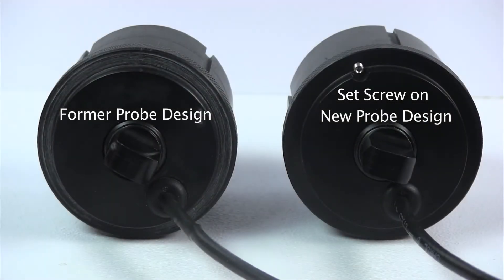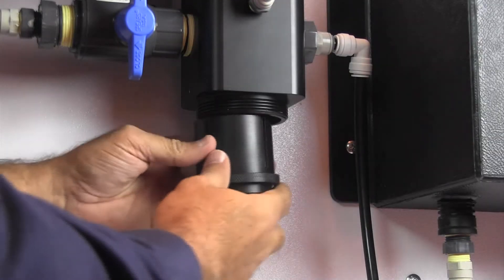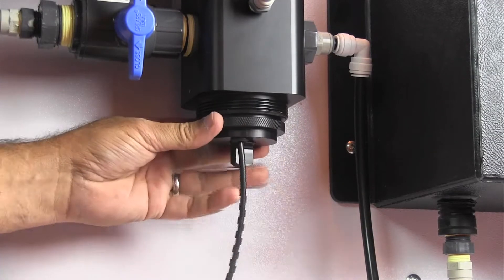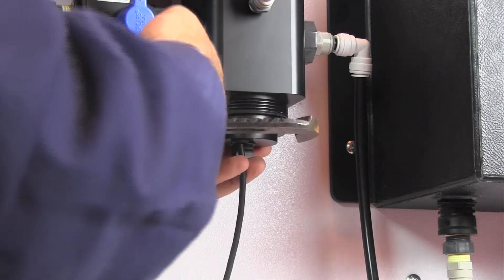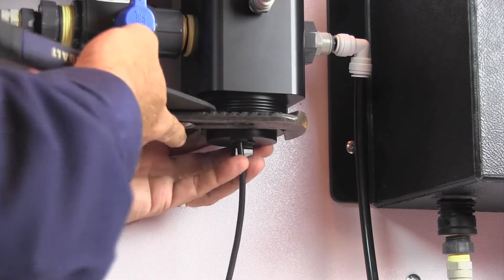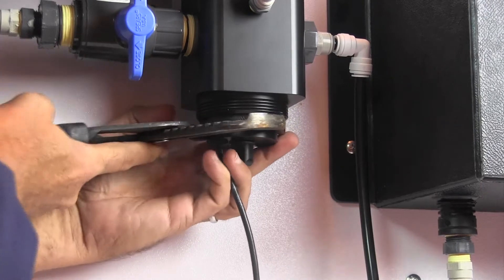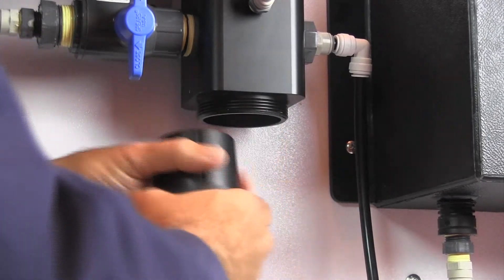It should be noted that on some earlier models there was not a set screw. If unable to unscrew the housing by hand, insert it back into the DT4 block and use channel locks to grip the knurled ring and loosen the housing.